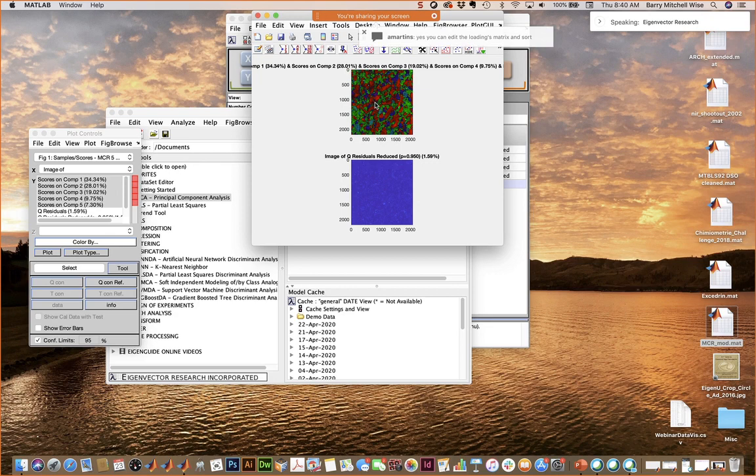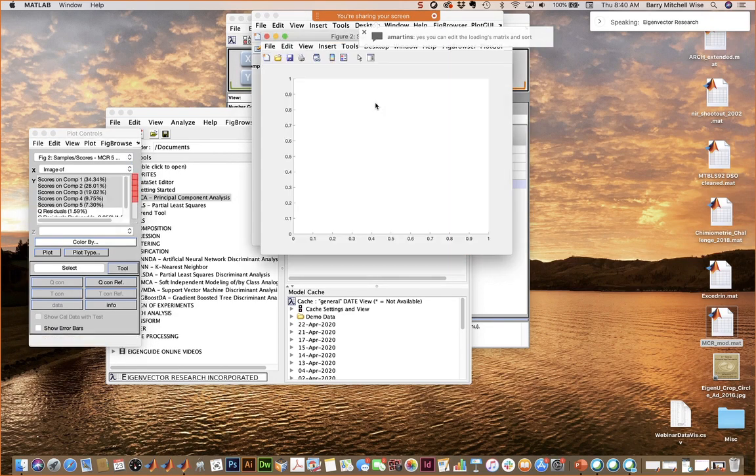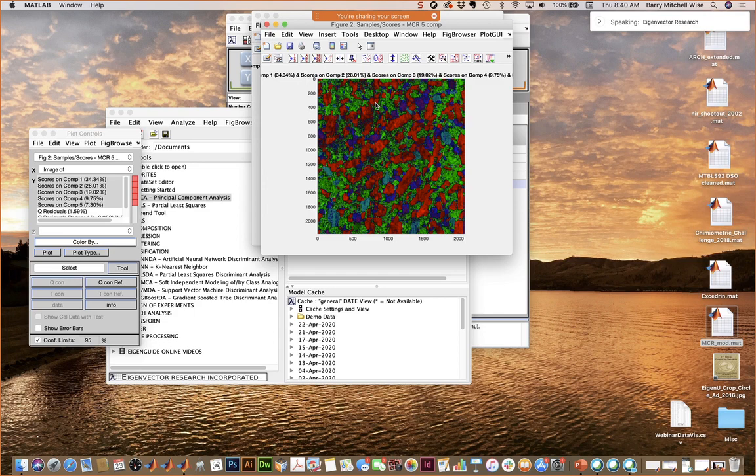Plot controls don't work on contribution plots. Any plans to update this? Oh, yeah, contribution plots are a standalone sort of thing, if you will. It generates them and then they're static. You can't change them, so I'm not sure what you'd want to change on that. So I guess there's no plans to update that, but you could pull the data out and plot it with plot controls.